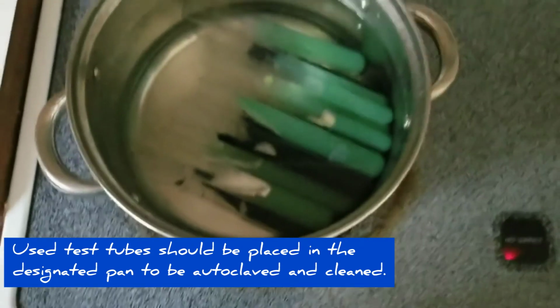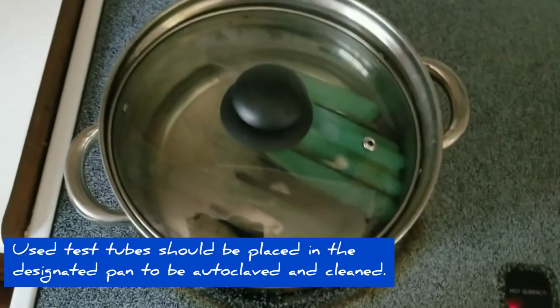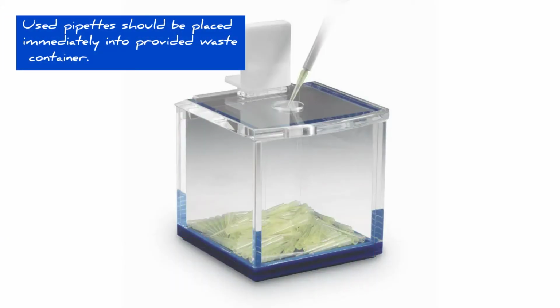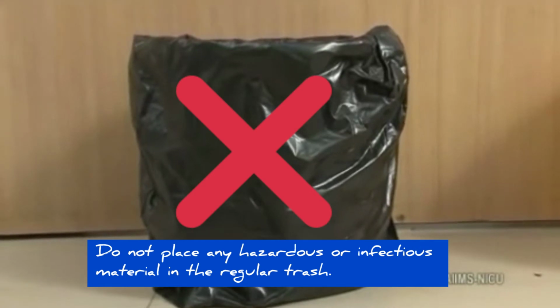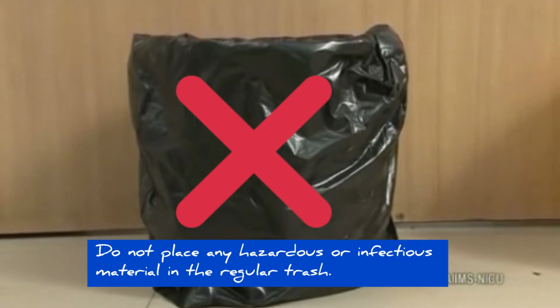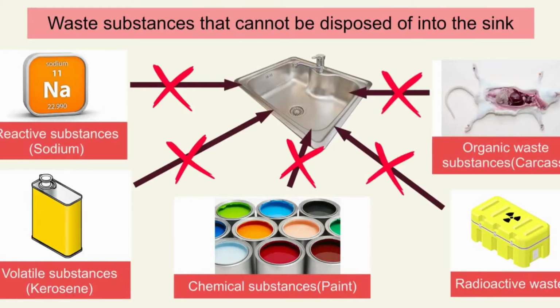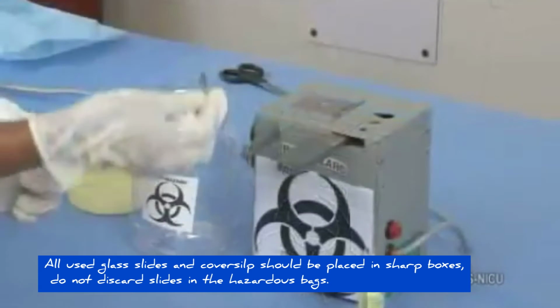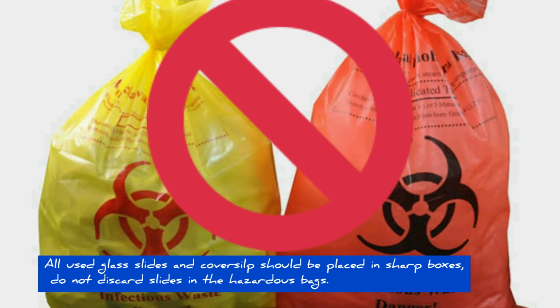Used test tubes should be placed in a designated pan to be autoclaved and cleaned. Used pipettes should be placed immediately into the provided waste container. Do not place any hazardous or infectious material in the regular trash. Do not place any hazardous or infectious material in the sink. Rule number 8. All used glass slides and cover slips should be placed in the sharps box. Do not discard slides in the biohazard bags.